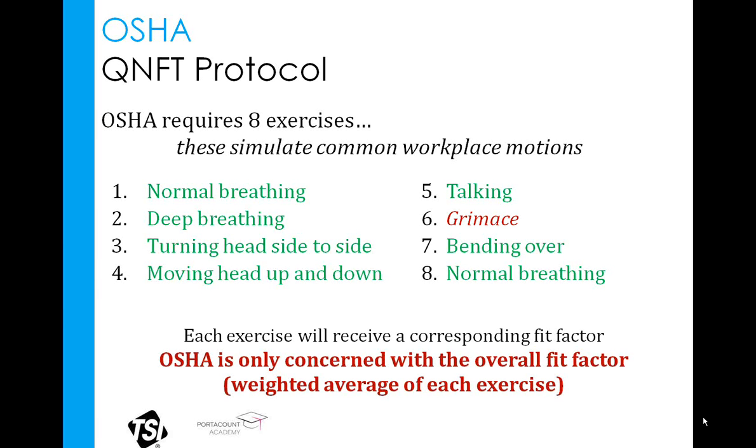I'm going to talk about Grimace on the next slide, so I'm going to get to that in just a second. And I'm also going to note that OSHA does require a person to be standing during a fit test. Okay, they should not be seated at any point. They need to be standing. And I also want to cover that OSHA is only concerned with the overall fit factor, not the fit factor for each and every exercise. One could potentially fail 1 or 2 exercises and still pass the overall fit test.